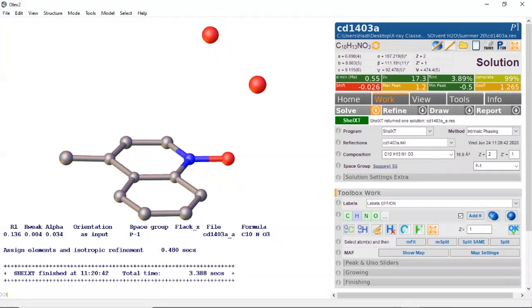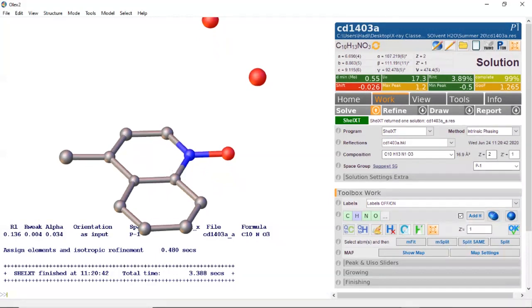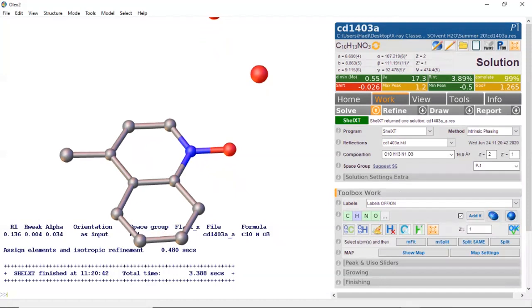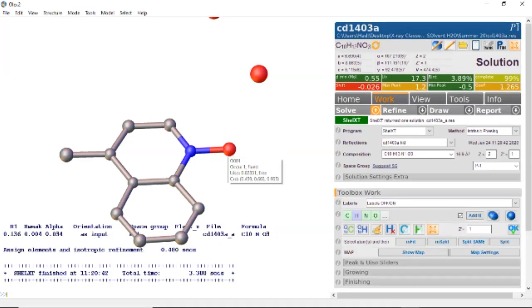But you may ask, well, how do I know this one here is an oxygen versus this one where it's carbon? And what we'll notice when we do the electron density map is you'll see 3 peaks off of this carbon and no peaks off of this oxygen. So those 3 peaks off the carbon signify hydrogen atoms, whereas no peaks off of this oxygen signifies it can't be a carbon, because you can't have a carbon with no hydrogens if it's a terminal carbon.